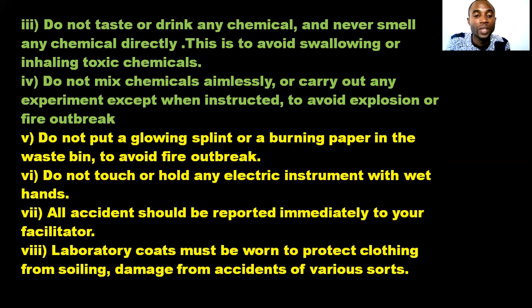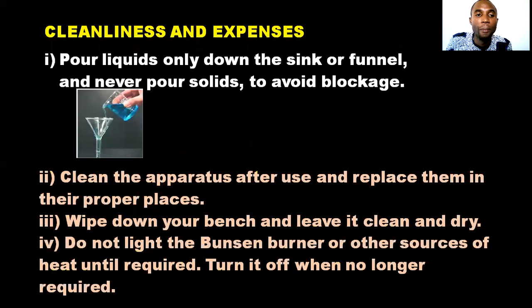Don't waste time. Laboratory coats must be worn to protect clothing from soiling and damage from accidents of various sorts. Wearing of lab coat should be compulsory. Don't joke with it, because it is a protective measure for you.